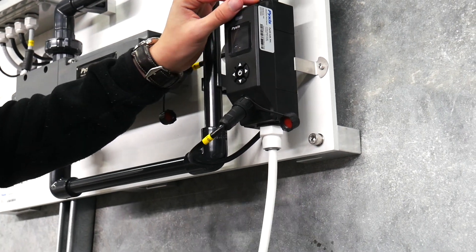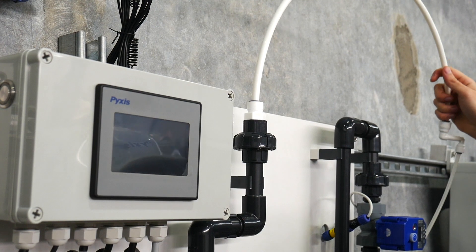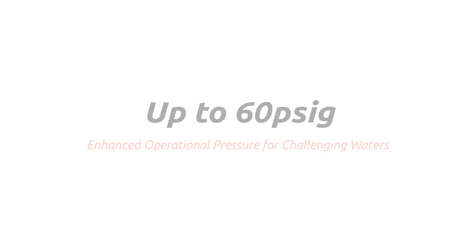Integrated schedule 40 CPVC piping in one-half inch MPT allows for higher operational pressure up to 60 psig, making it ideally designed for challenging cooling and process water applications where a returned sample to atmosphere is not available.